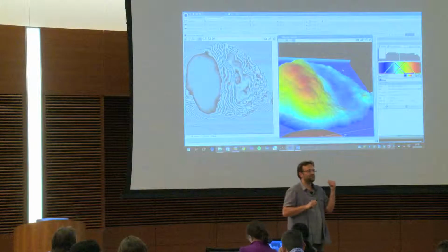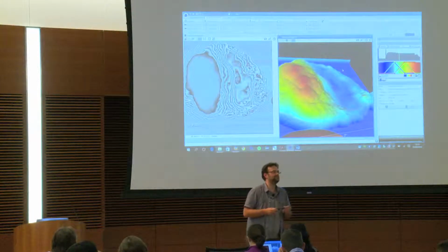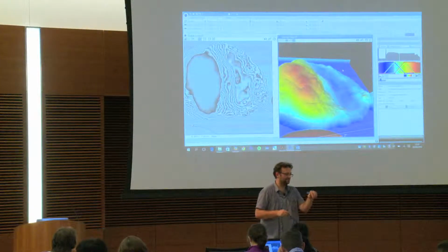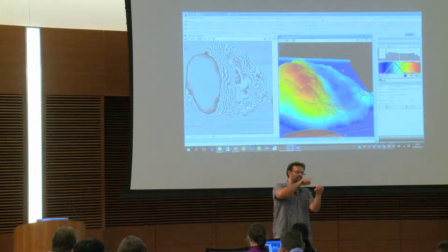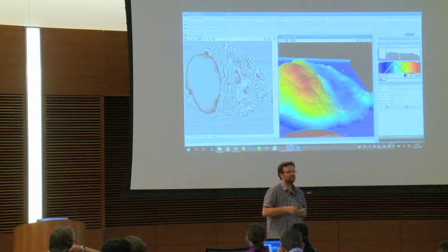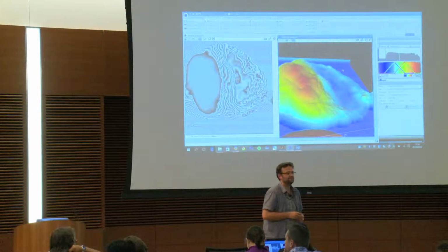You can be sure that if you don't say this, after 2 years of work, the biologist is going to come to the boss and say, okay, I have a fantastic result. The cells that are very bumpy, they don't have knobs, and the other have knobs. And it will be only an artifact of this problem here, okay?